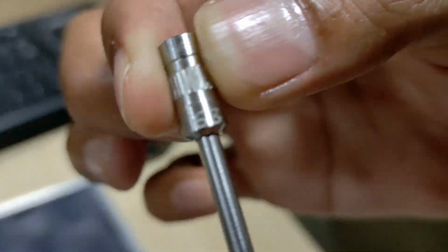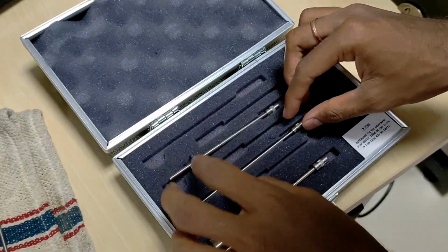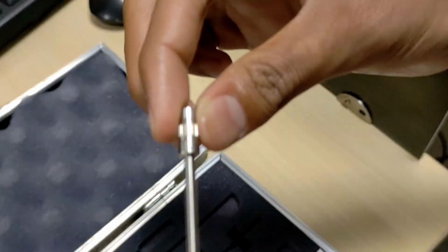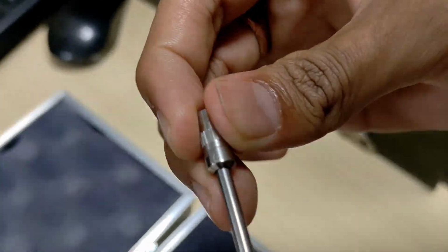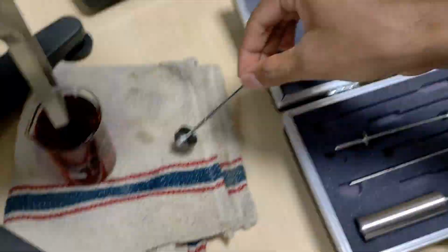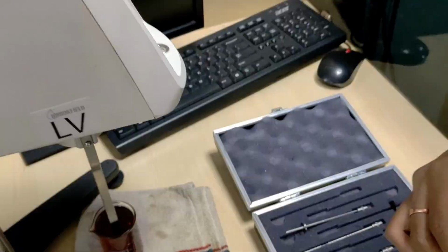So this is the 63 spindle, and this is the 62, and this is the 61 spindle. And now we are going to use the 62 spindle for our experiment.